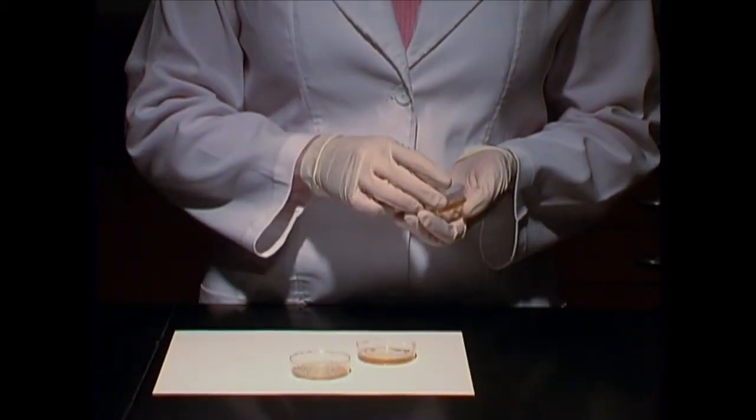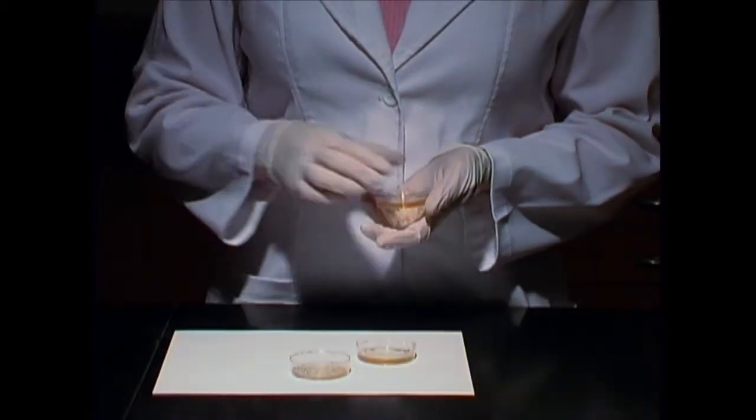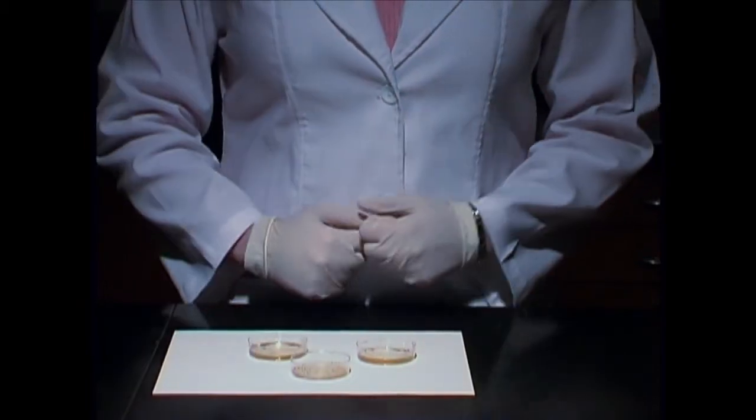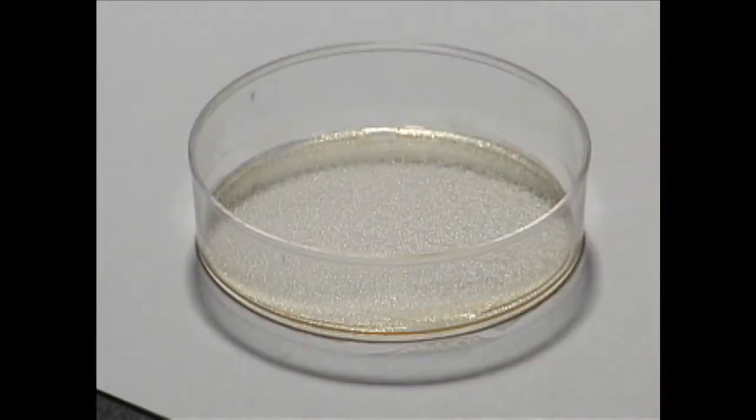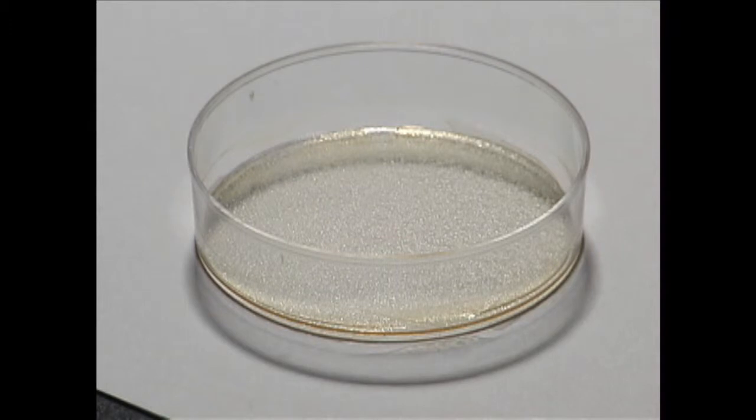Each plate should produce a different result. Control-1 was not exposed to the PUC8 plasmid. Its agar was infused with the inducer IPTG and the substrate X-gal, but in the absence of PUC8, they will have had no effect. After incubation, the competent cells should have freely reproduced and may look like a smeared layer or a lawn of white cells.